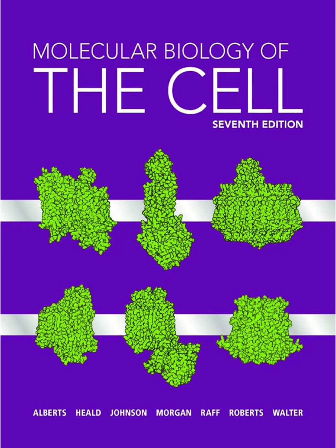Oh yes, scattering limits penetration. Usually you can't get much beyond maybe 150 micrometers with standard confocal. For going deeper into living tissues especially, you need multiphoton microscopy. Multiphoton, how's that different? Instead of exciting the fluorophore with one high-energy photon like blue or green light, you use two, or sometimes three, lower-energy photons arriving at the fluorophore at almost exactly the same instant. Lower energy means longer wavelength, like infrared.